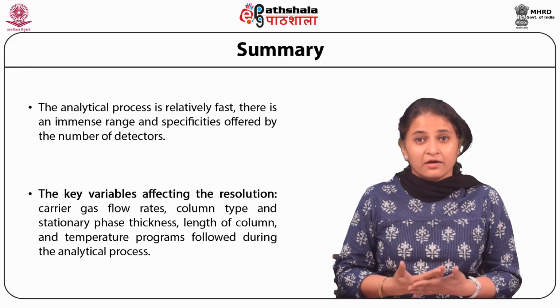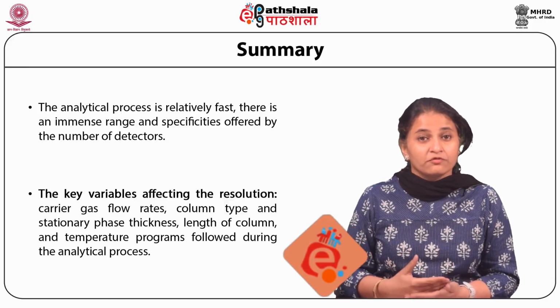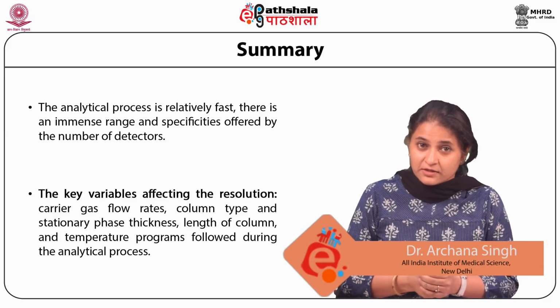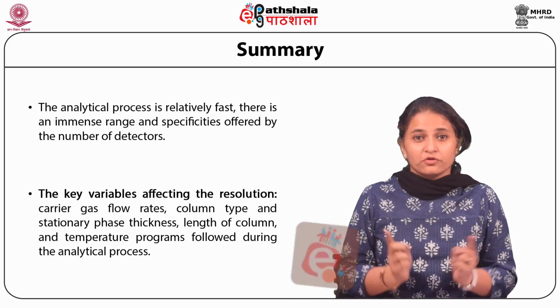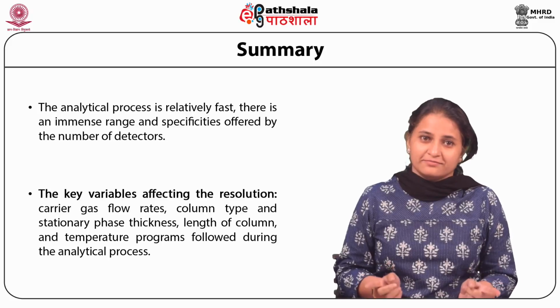These variables are the flow rates of the carrier gas, the type of column being used, the thickness of the stationary phase, the length of the column, and the temperature programs that are followed during the analytical process. Thank you.